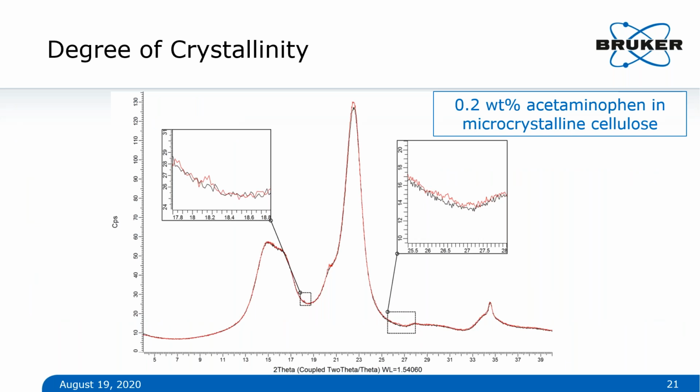So this is also going to be dependent on your site. A lot of the diffraction quantification techniques have been derived from things like GC mass spec or traditional chromatography, where you would do a signal to noise calculation. So here, if you look on the left-hand side, I would figure out that I've got about 1 count per second from the baseline for that red peak, and then the wobble there in my noise. You set an upper and lower threshold for your noise.